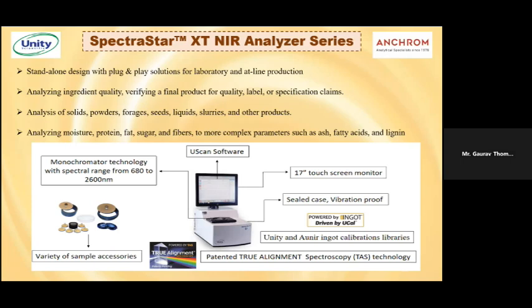From all these different kinds of samples, it is able to analyze various kinds of matrices. To name some, we have moisture, protein, fat, sugars, and fibers, and even some complex parameters like fatty acids, lignins, and amino acids as well.